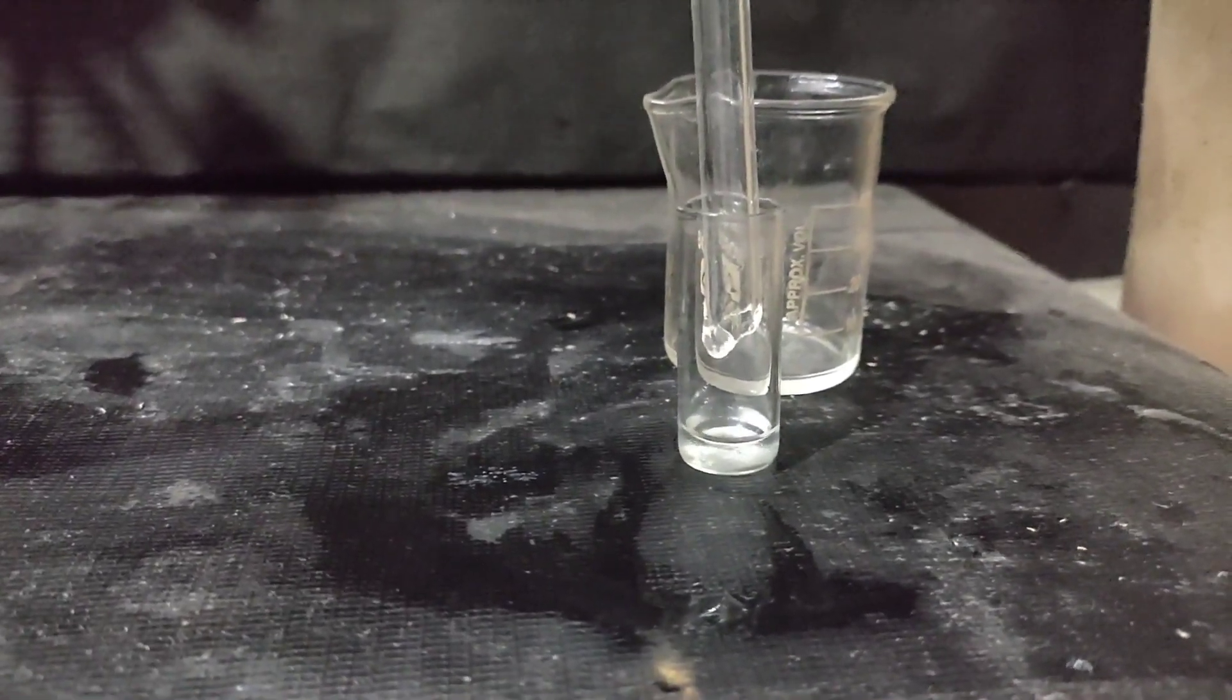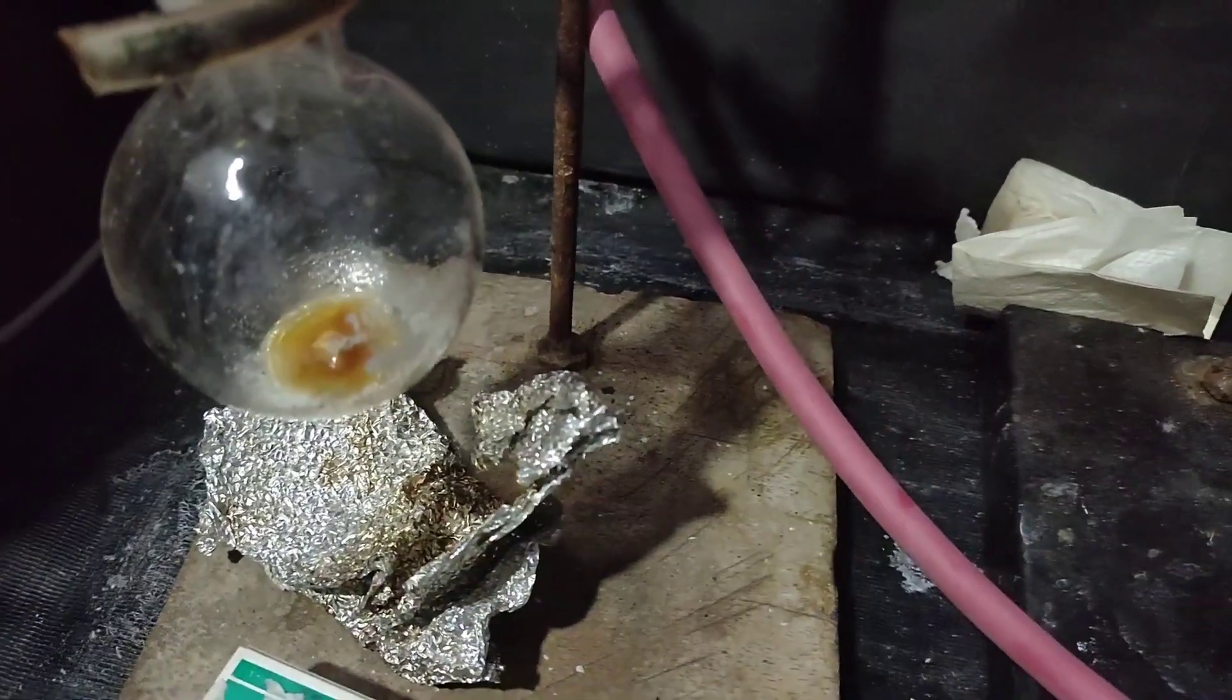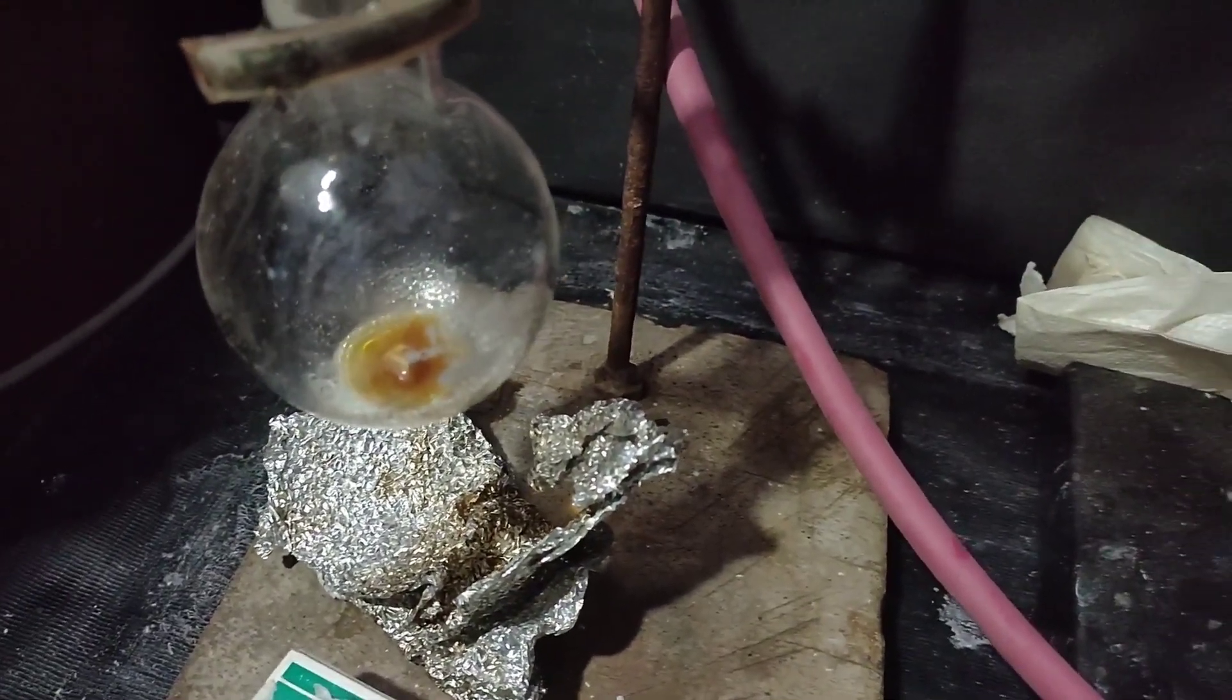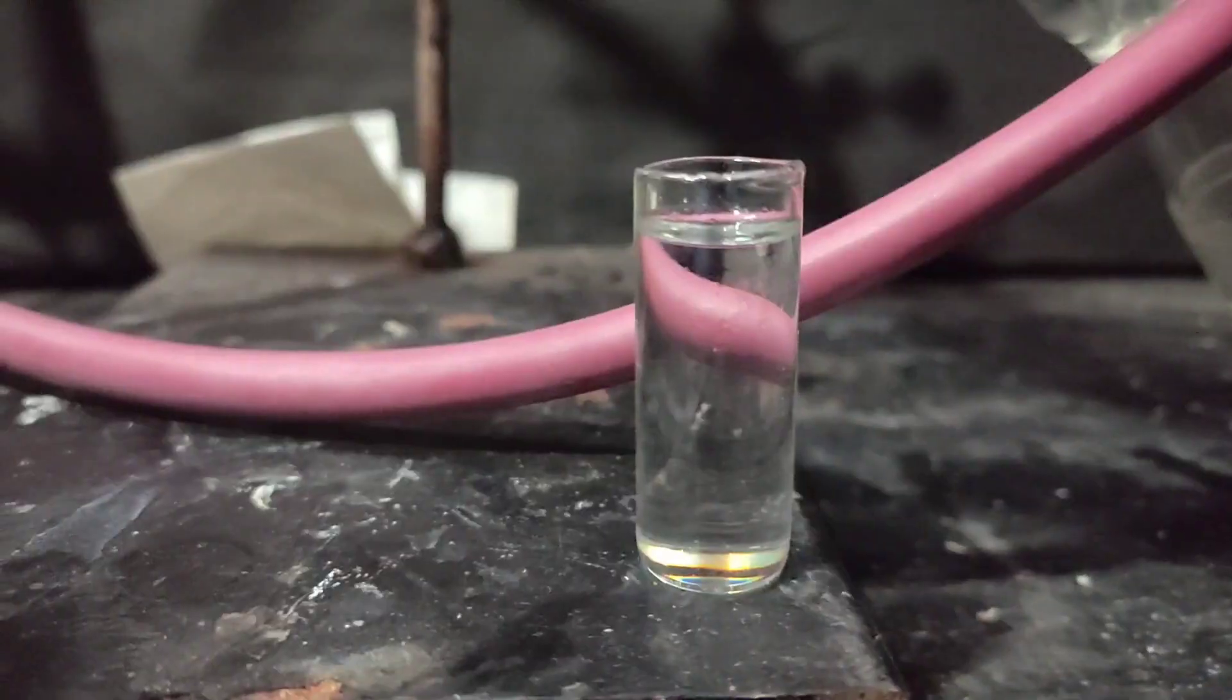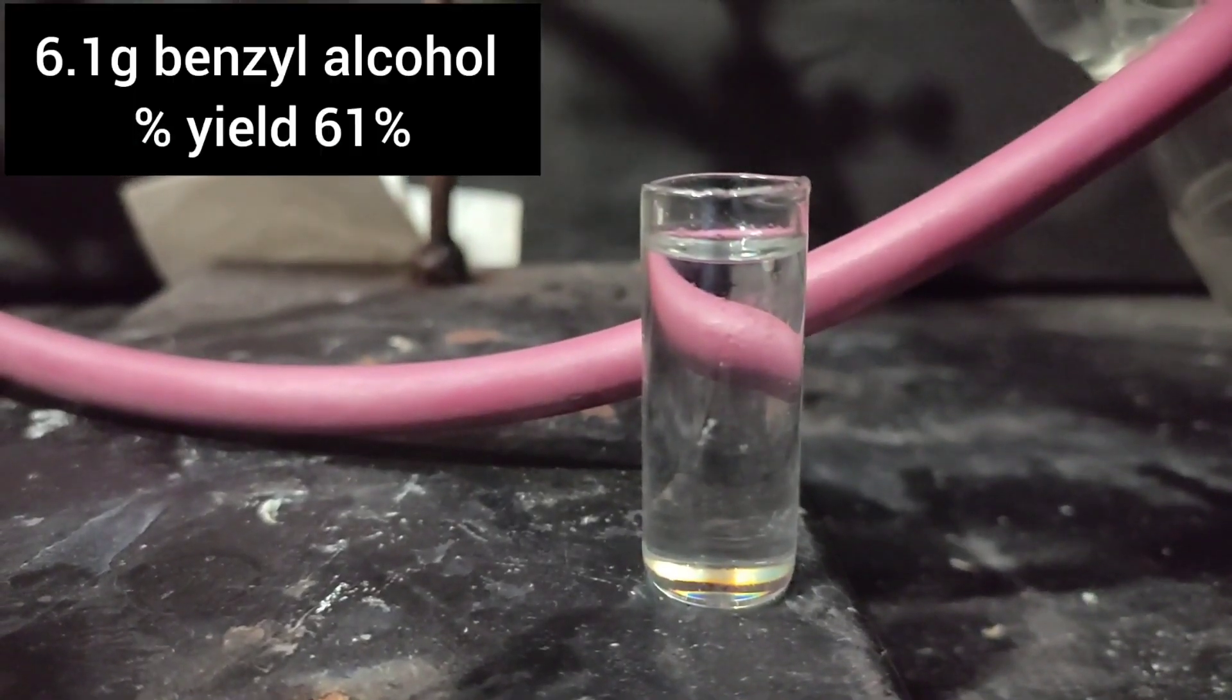When very little liquid remained in the flask, nothing came over. So I stopped heating. 6.1 grams of benzyl alcohol was obtained which corresponds to a percentage yield of 61%.